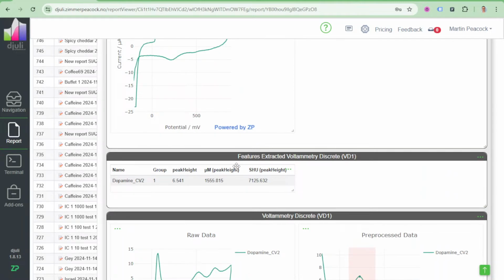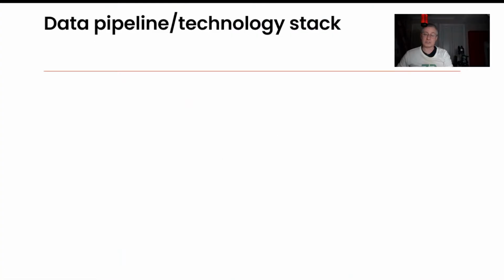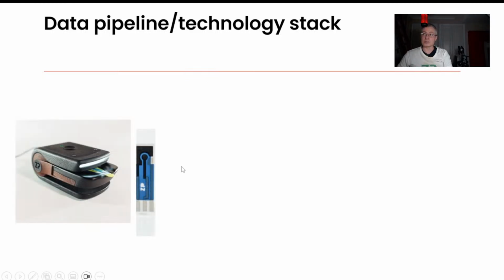That means this is not like another paper that's trapped in the literature. If people are doing biosensor development on the Sensi potentiostat and using our screen printed electrodes, they're able to make an impact. And I think government's going to be much happier with people who are able to demonstrate an impact.